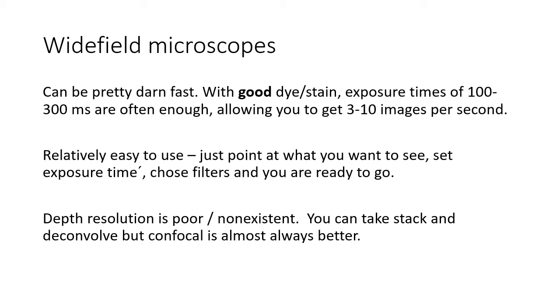They are pretty easy to use. You just point at what you want to see, set the exposure time, choose the filters, and you're good to go. The problem is that they have a really poor depth resolution, as discussed before, and while you can take a stack and deconvolve the stack, confocal images are almost always better in this case.